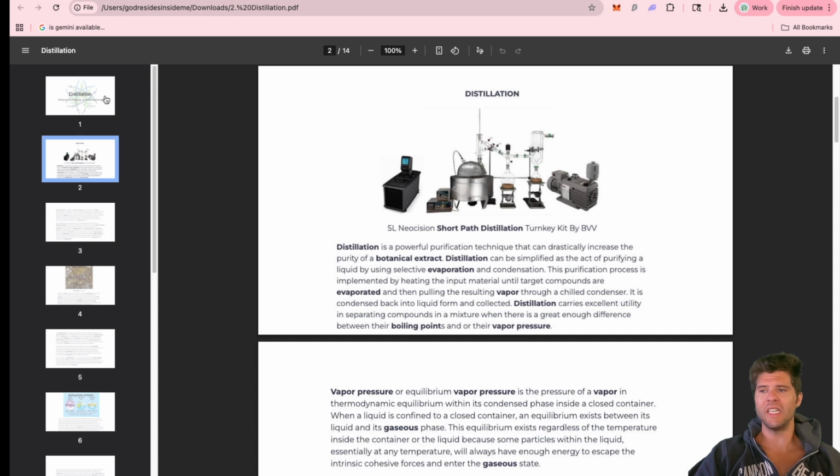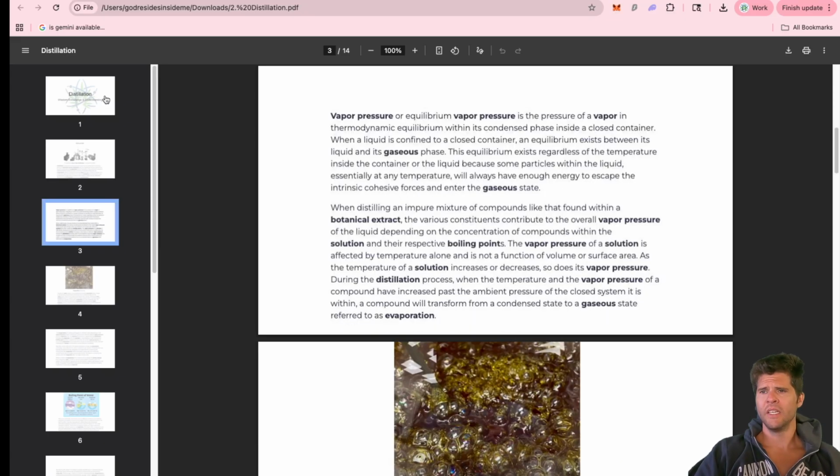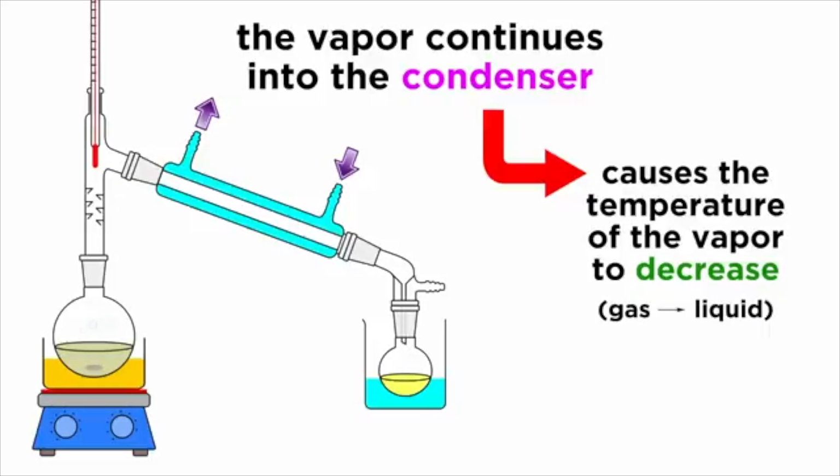And that is just incorrect because the boiling points of the three compounds are similar. Very similar. And you'll understand more what I'm talking about as we go through the theory here together. But anybody who tells you that, that's a red flag. That is a rookie. Do not believe them. You cannot do it.